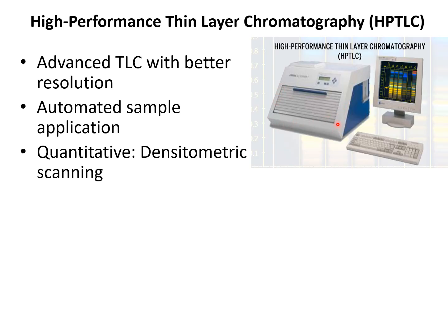And hence, in this type of thin-layer chromatography, it does not require all the manual methods we discussed in the ordinary thin-layer chromatography. Everything is automated, and hence it has more application. It can be applied both qualitatively and quantitatively to detect and analyze in a sample.